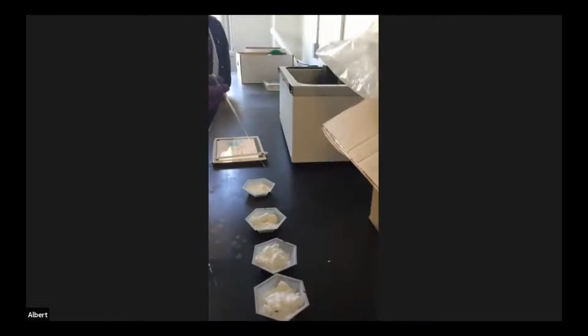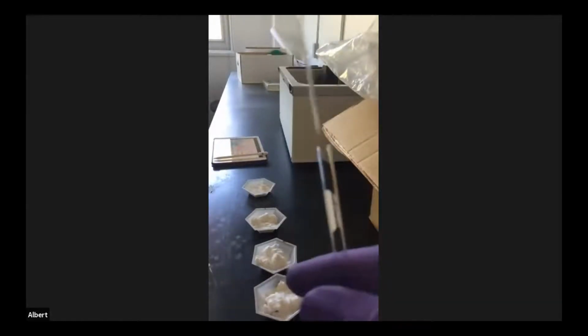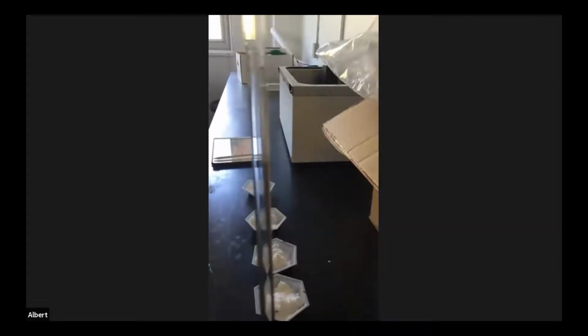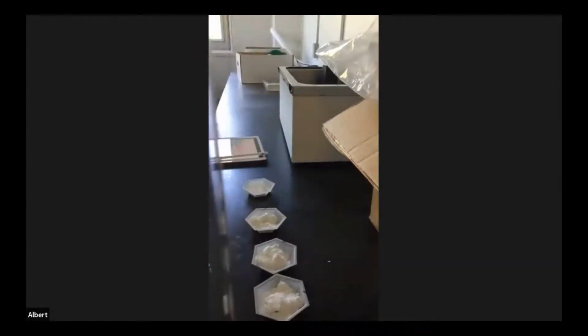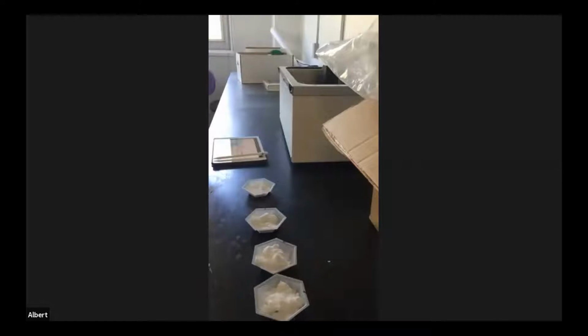Right, you can see I have some material at the bottom of that pipette, and I'm just going to stick that down into here for now. All right, when we get downstairs, I'm going to add my solvent and dissolve this up. But for right now, we have enough material in here to get a good NMR spectrum. All right, so that's the crude. So let me move that out of the way.